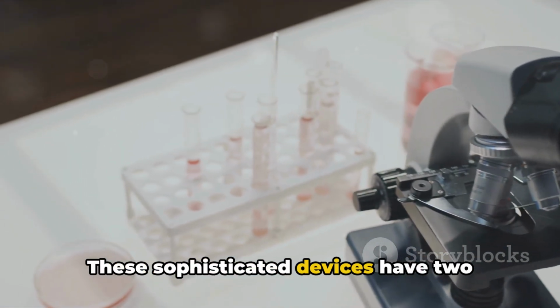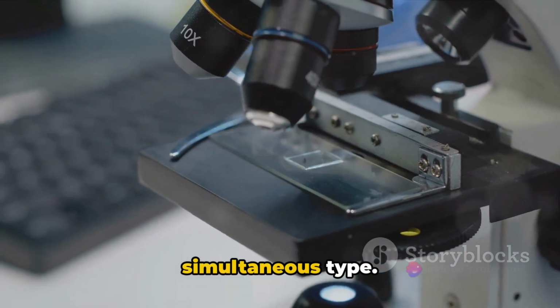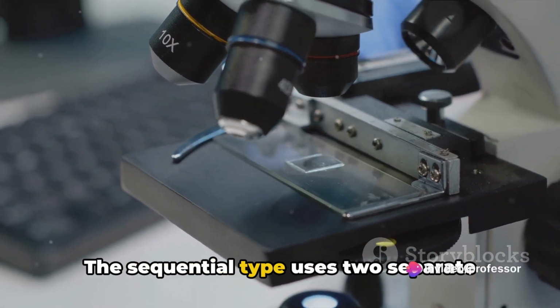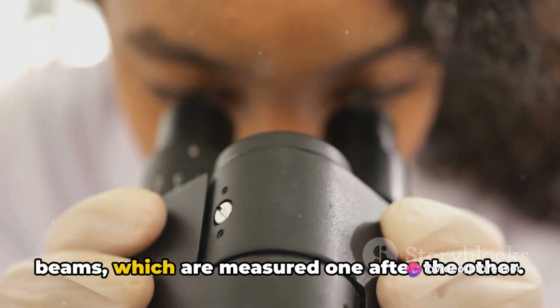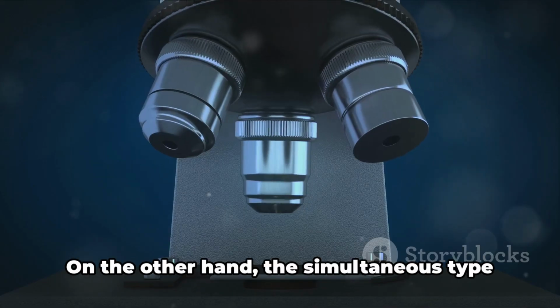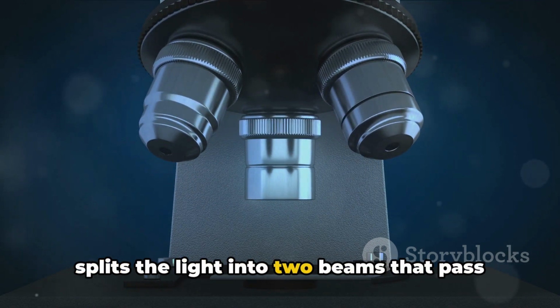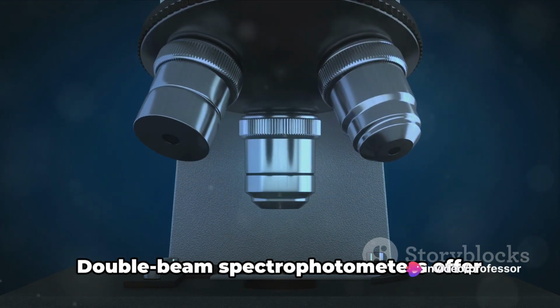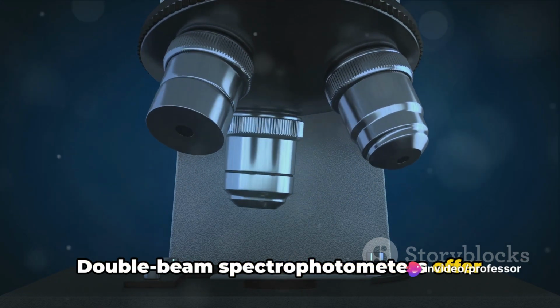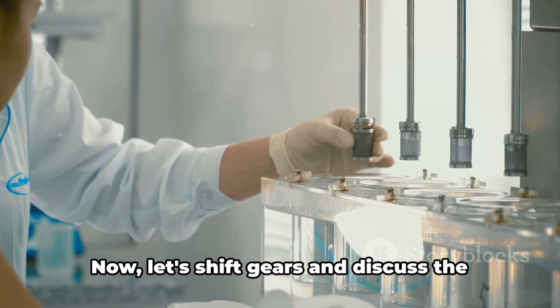These sophisticated devices have two types, the sequential type and the simultaneous type. The sequential type uses two separate light paths for the reference and sample beams, which are measured one after the other. On the other hand, the simultaneous type splits the light into two beams that pass through the sample and reference cells concurrently. Double-beam spectrophotometers offer higher accuracy, precision, and are perfect for complex analyses.